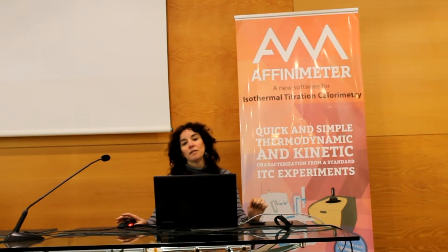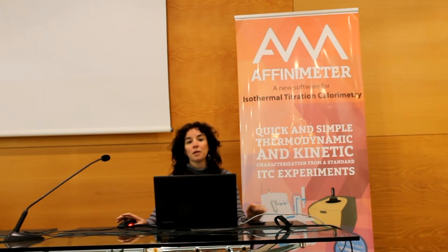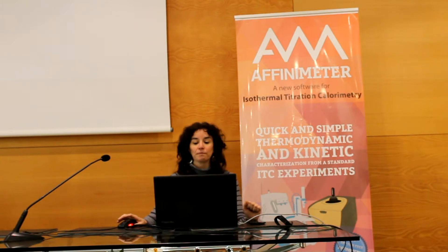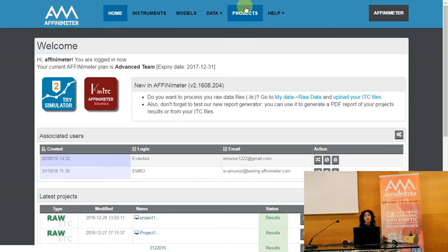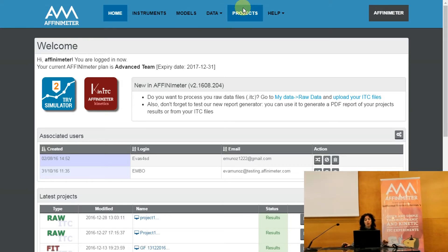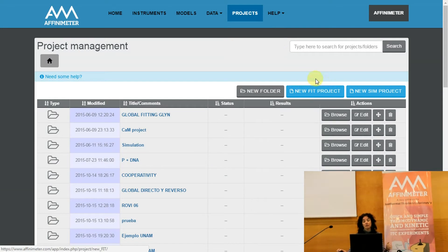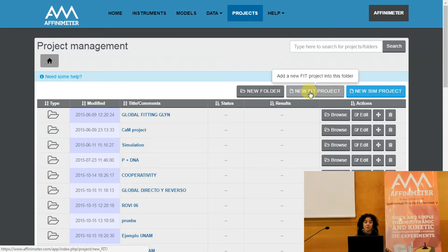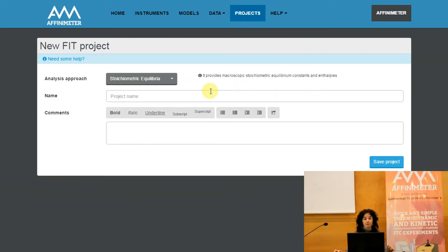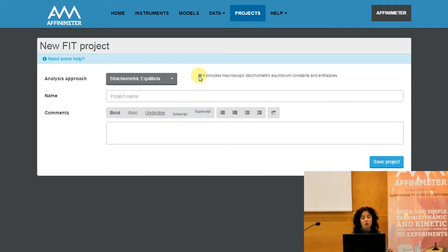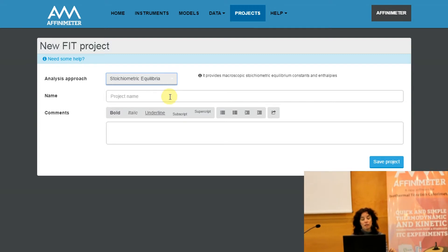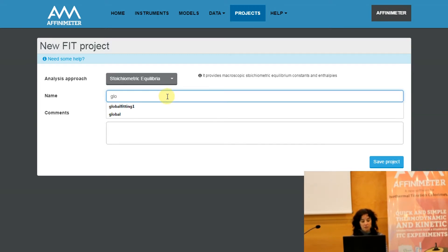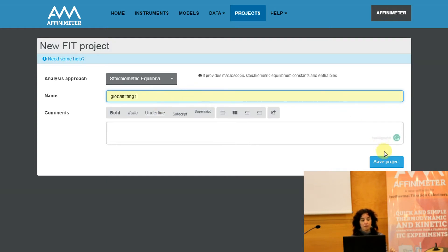In this tutorial we are going to learn how to perform global fitting with AFFINImeter. For this we have to go to the option Projects of the main menu, and into Projects we are going to create a new fit project by clicking on the option New Fit Project. We will select the option Stoichiometric Equilibrium Approach, name the project, and click on Save Project.